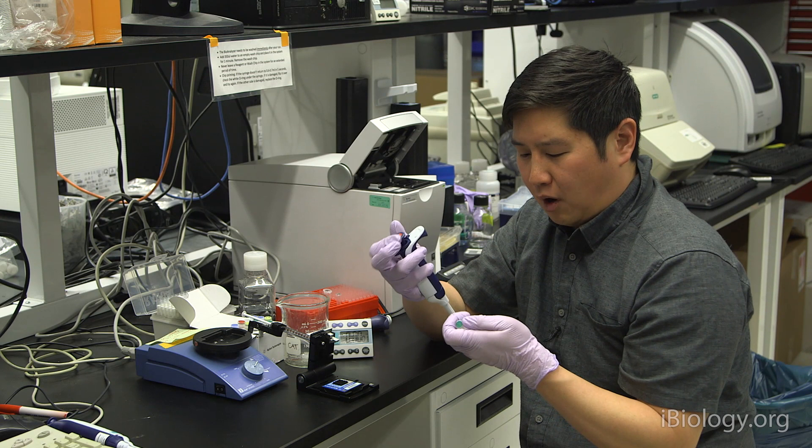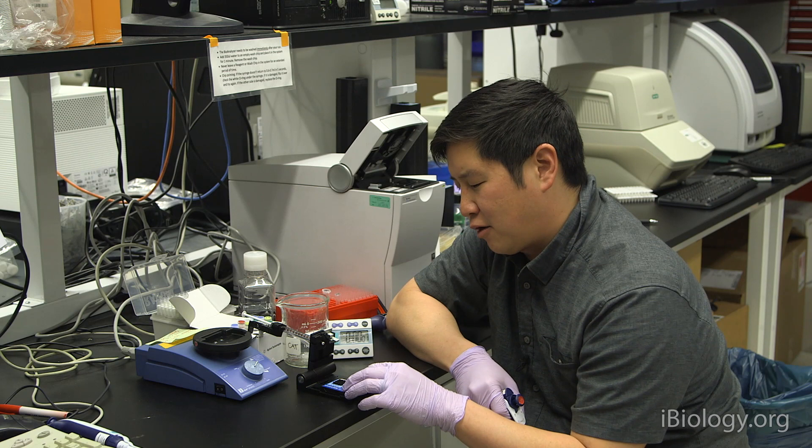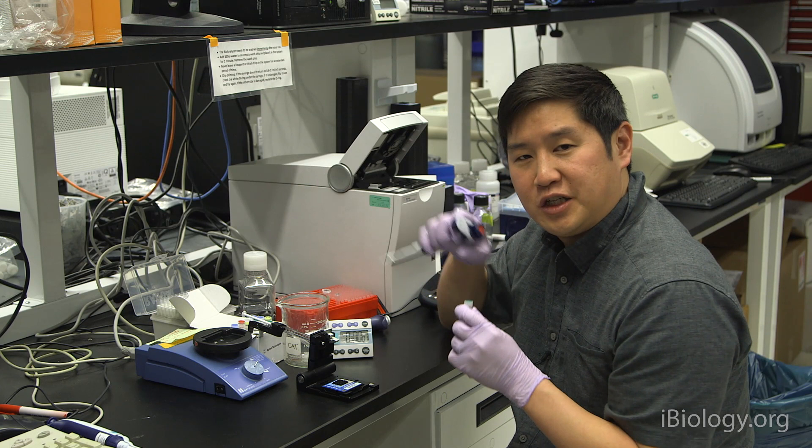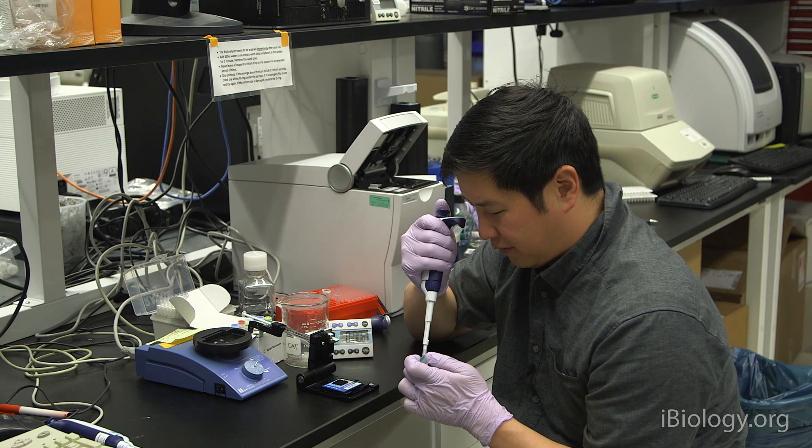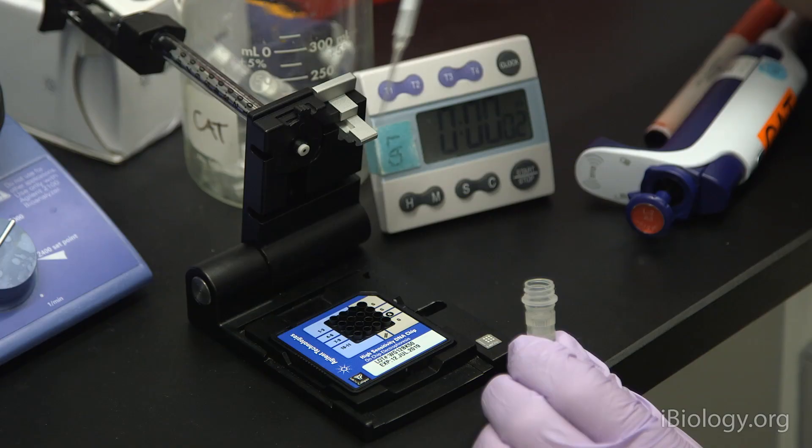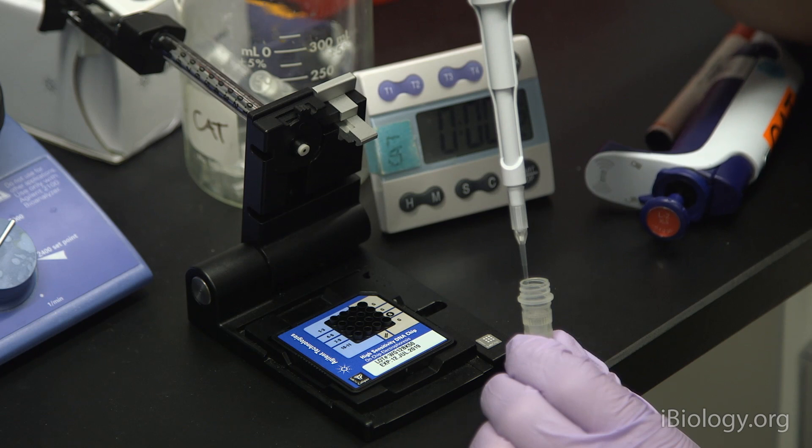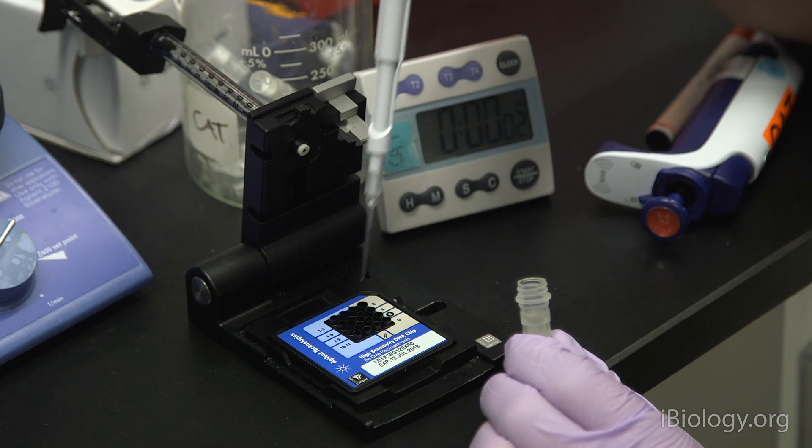Next, we're going to add 5 microliters of a marker solution to each of the sample wells and the ladder wells. These are the 12 wells to the left of the chip. We don't add these to the gel wells that we've added material to already. You can use the same pipette for all of these, as well. This just contains an upper and lower marker that can be used as reference standards to compare your sample to the ladder.